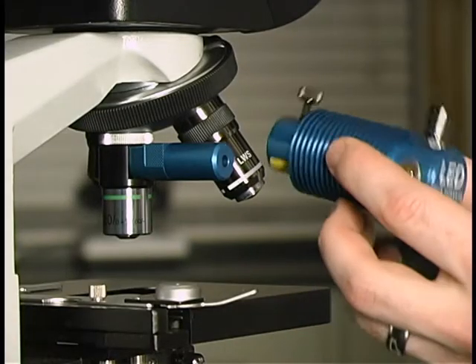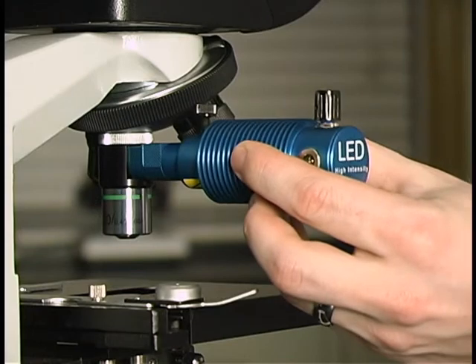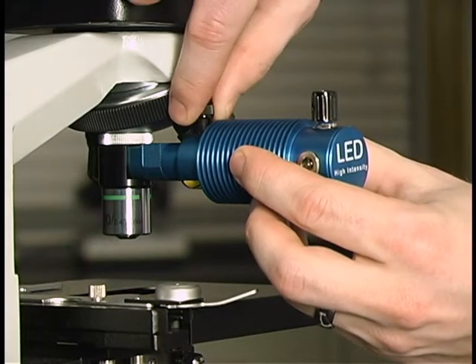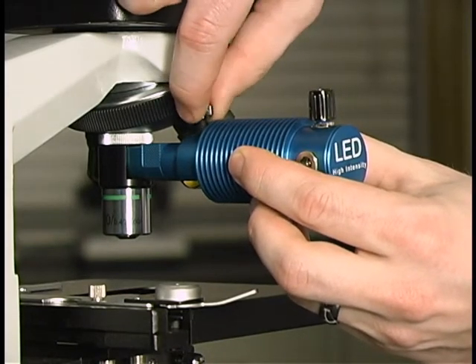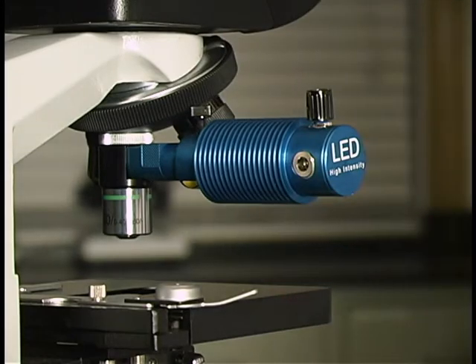Next, slide the LED light source directly onto the filter set arm. Join these two components together and tighten the thumb screw on top to secure them in place.